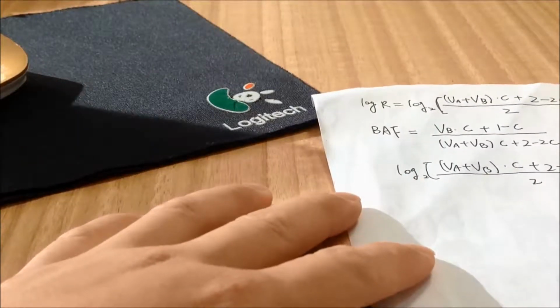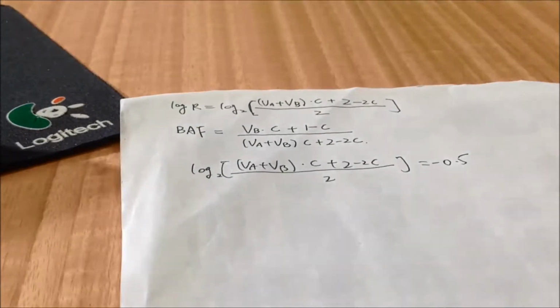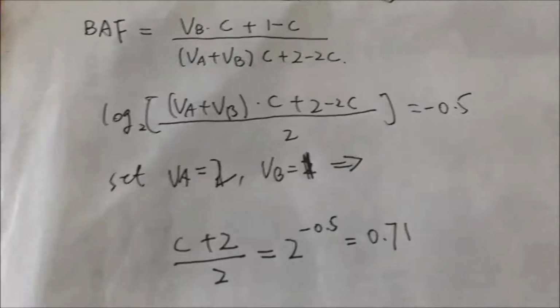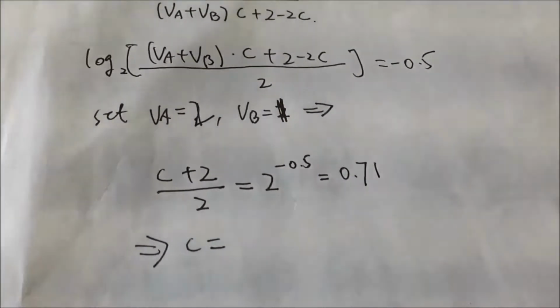This is about minus 0.5. Then in this case, we know that it's a copy number loss, and from its log ratio of minus 0.5, we can already know that's a copy number loss.